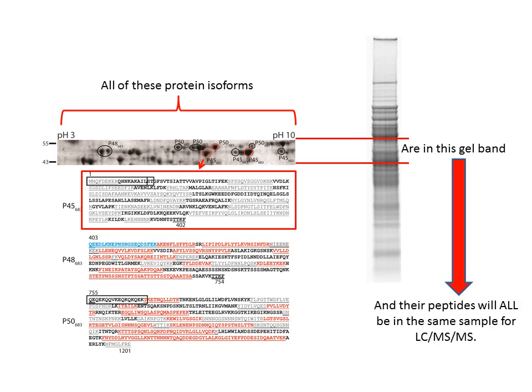For gel spot-based protein identification, this could have a number of implications. Firstly, a protein can be more confidently identified from fewer peptides because of the additional pI and mass information. Secondly, because the sample subjected to LC-MS-MS only contains peptides from a single protein, its complexity is less, ion suppression would be reduced, and there is a higher likelihood of detecting lower abundance peptides and therefore increasing protein sequence coverage.